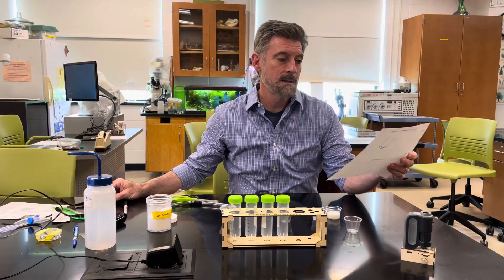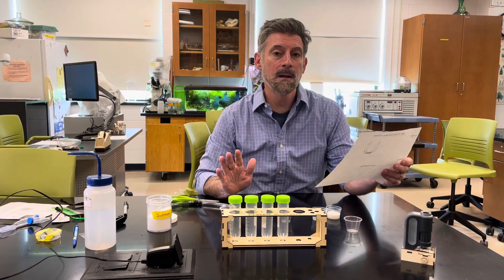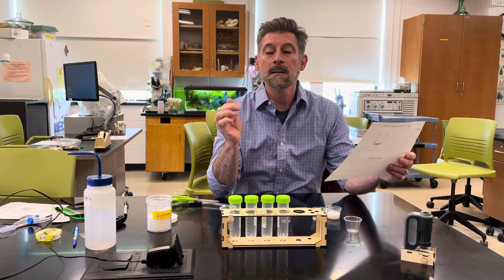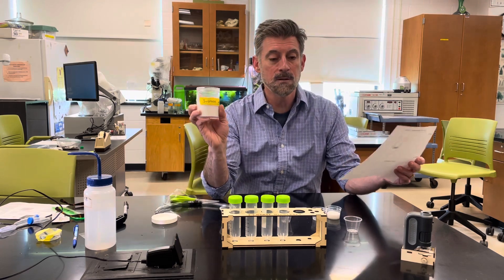We're going to set up this laboratory, which is an osmosis lab. We're going to be looking at how water moves across a membrane and how the concentration of a solute — in this case, sugar, specifically sucrose which is just table sugar — affects that movement.